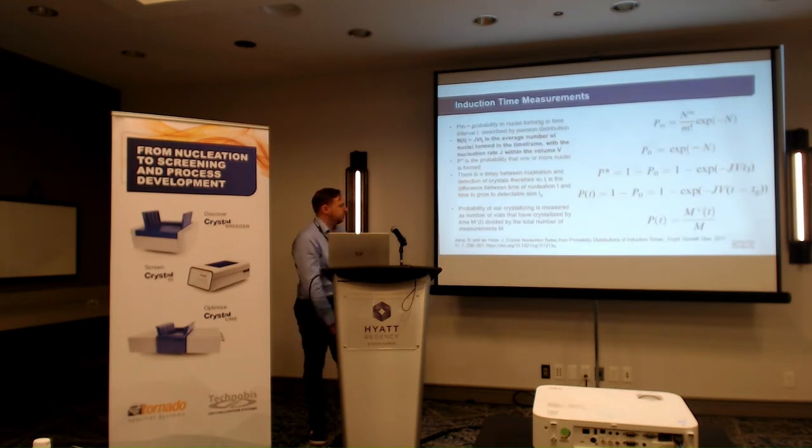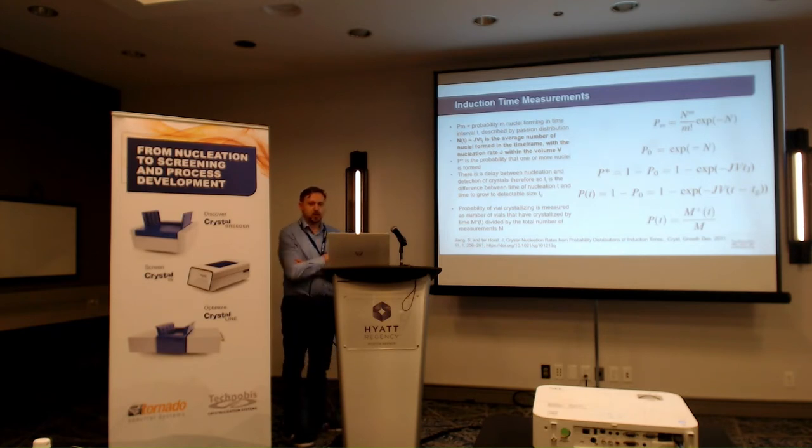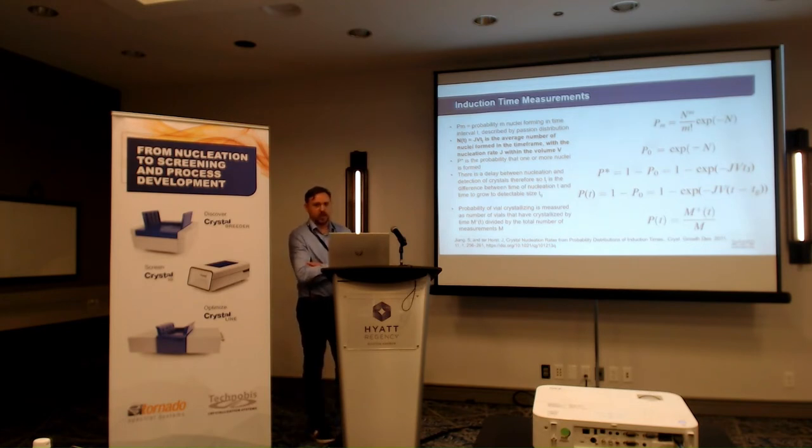So a method was developed by Dr. Horst using the Crystal16 version 2 that made use of induction time measurements using the turbidity sensor in order to determine that stuff about the nucleation rate. There's a lot of math. I'm not going to go entirely into it because I'm not a big fan of that amount of math.